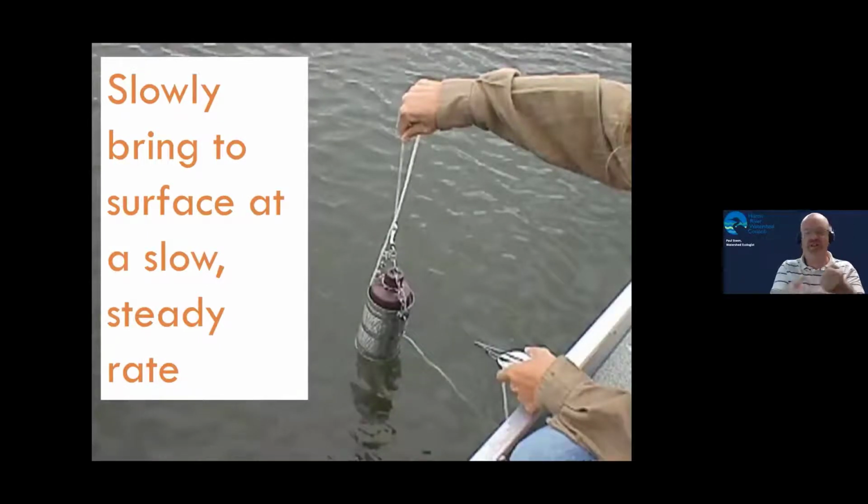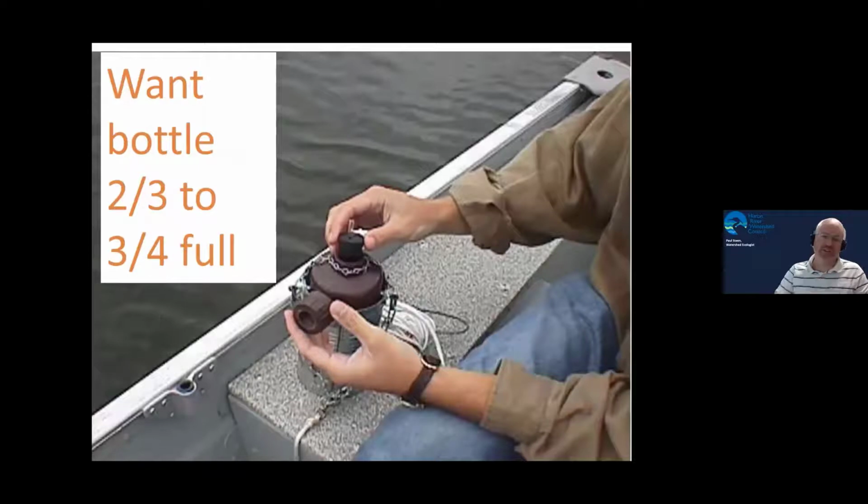Then at a slow, steady rate, you bring this sampler back up to the surface. Now this may take some practice, and I can't really tell you exactly what rate to do it, because it depends on your particular piece of equipment and how deep your depth was that you dropped it to. But your overall goal is that you want your bottle somewhere between 2/3 and 3/4 full. So after you pull it up, take the rubber stopper and the cap off and look at how much water you actually have in there.